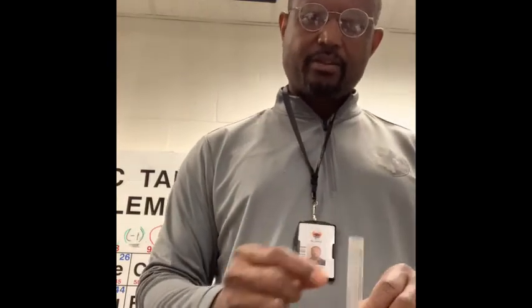We're going to be testing our phosphate level using our phosphate test kit, just like nitrate. It comes with a series of instructions on the back, and we have a test tab. In this case, we'll have one, and we start with putting 5 milliliters of water in our vial.